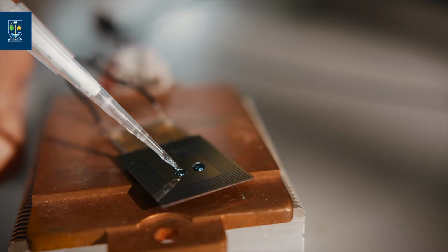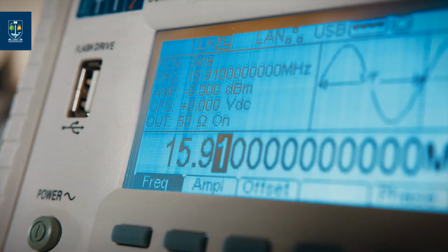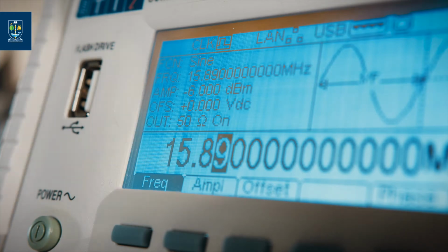The technology is a way to manipulate acoustic waves on surfaces and their interactions with liquids through these holographic structures. We call them phononic structures. The idea is that the structure is responsive to the acoustic excitation. So if I change the frequency, so the tone of the acoustics, I get a different shape of the waves on the surface. And so I get a different function.